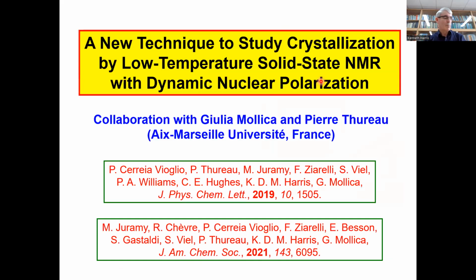I'd like to just mention that we're also collaborating with Julia Mollica and Pierre Thureau from the University of Marseille in France on the development of an alternative technique to study crystallization by dynamic nuclear polarization NMR.